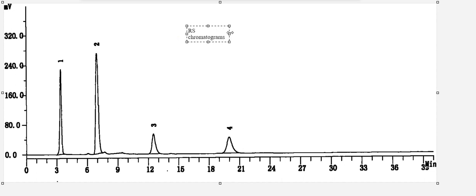Today, I would like to explain about the RS chromatogram and how to process the RS chromatogram in sample preparation. Here in sample preparation, I would like to explain the formulation process, taking a formulation as an example, the procedure for an RS HPLC chromatogram.